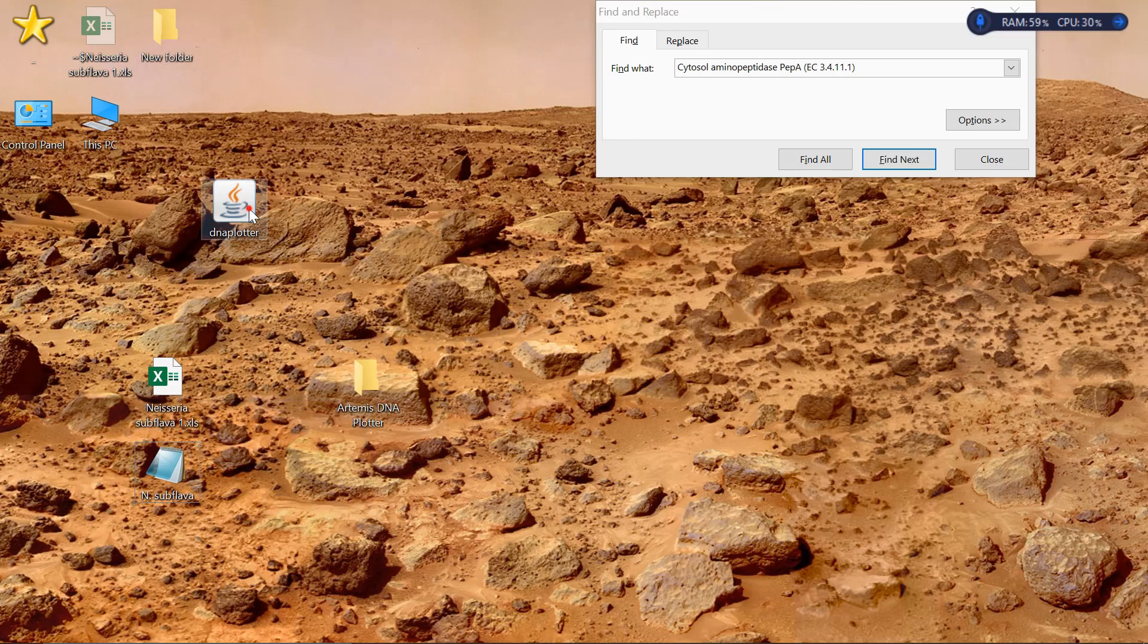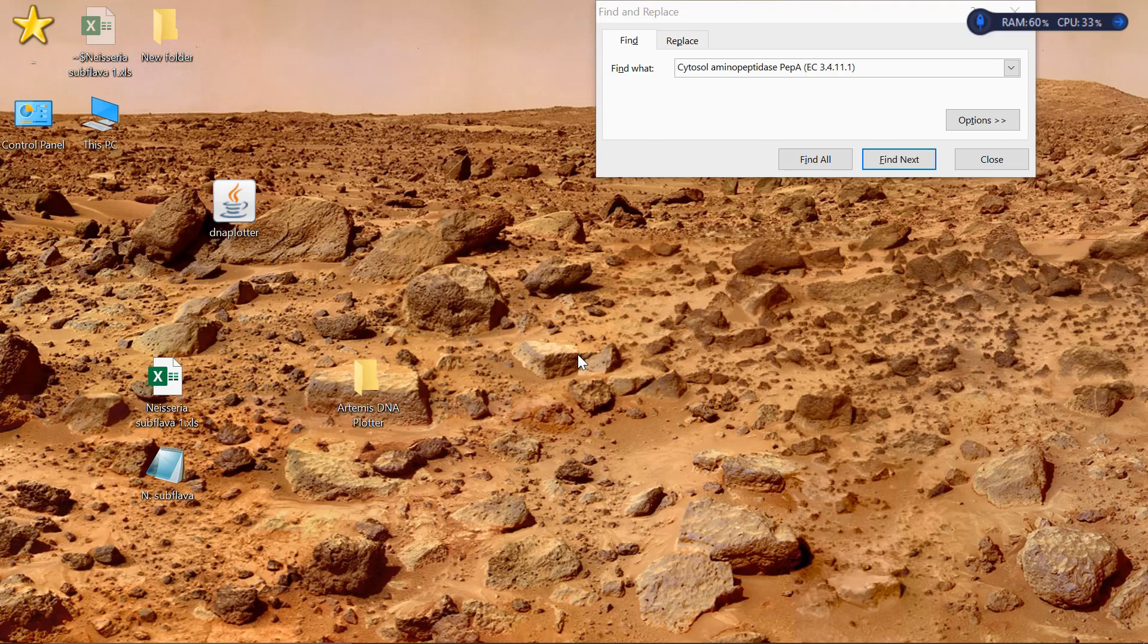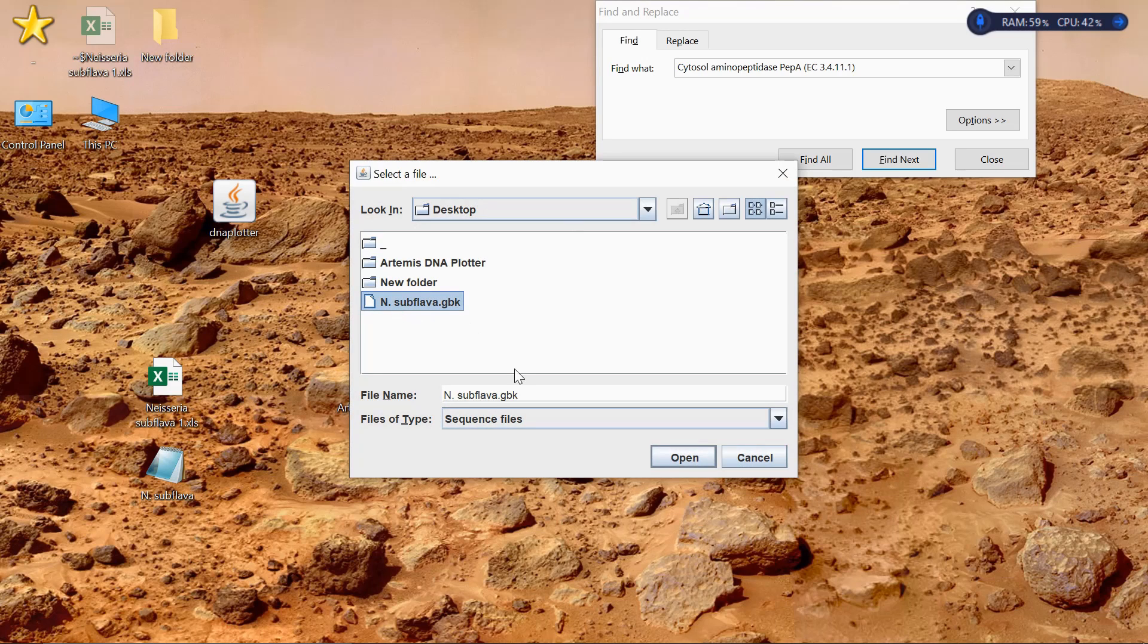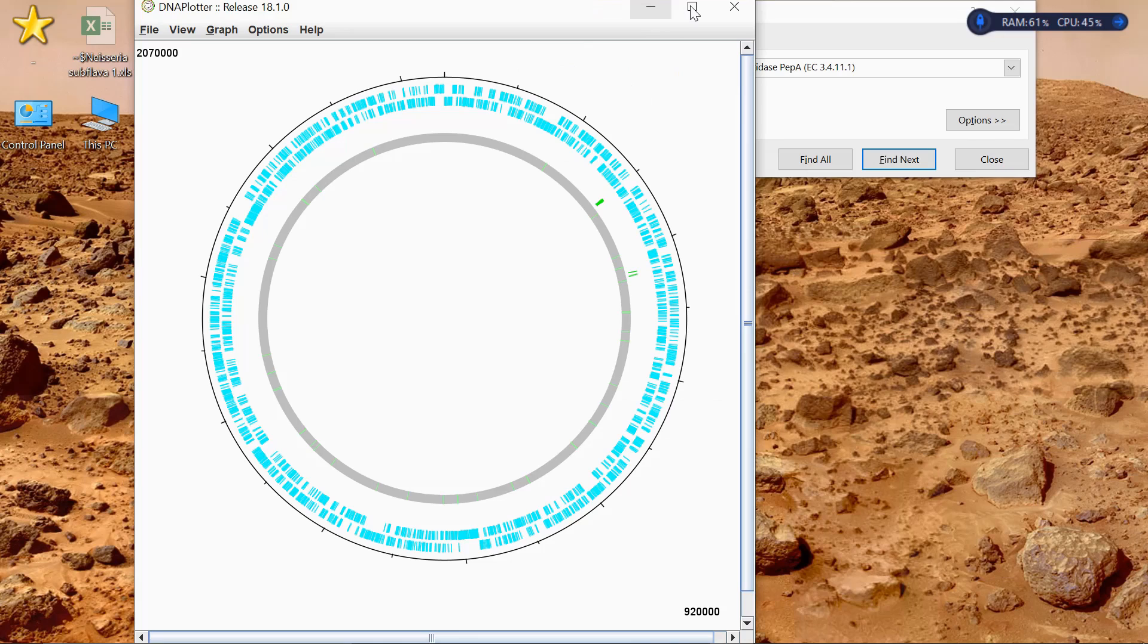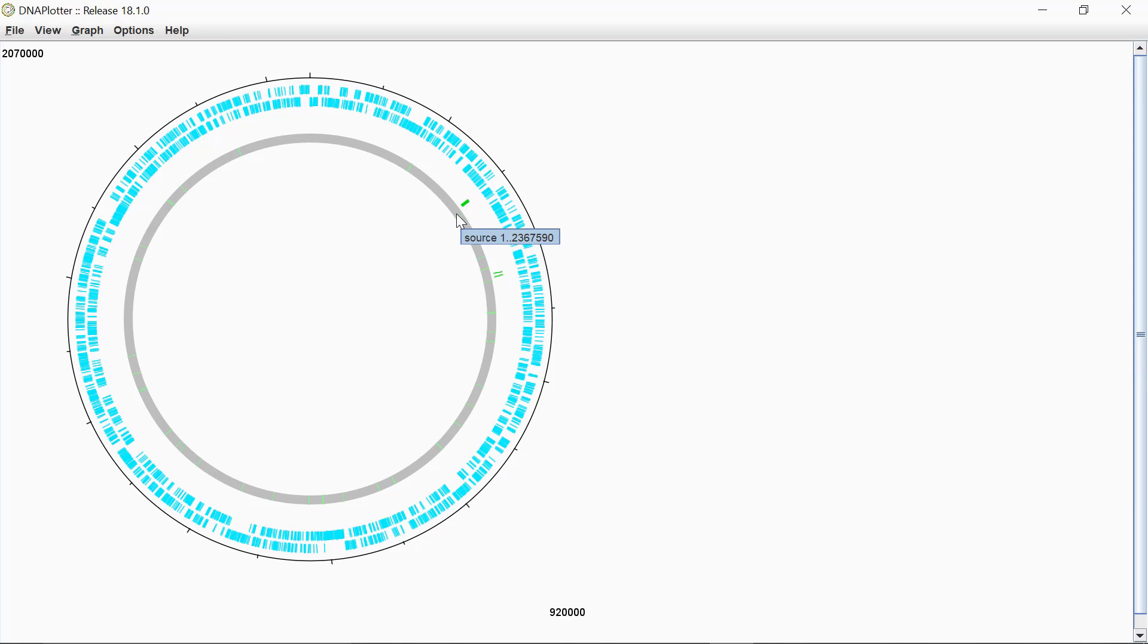First I open up the Artemis DNA Plotter tool. It asks you to read in a sequence file or read a template file. For this you want to read in a sequence file. And then I'm going to select from the desktop this GenBank file here. This is for Neisseria subflava. So enter that. And what you see here is the DNA Plotter. It's a single circular chromosome and you've got genes on the forward strand and the reverse strand. And then there's a couple of other tracks in here that you can see with other features in.